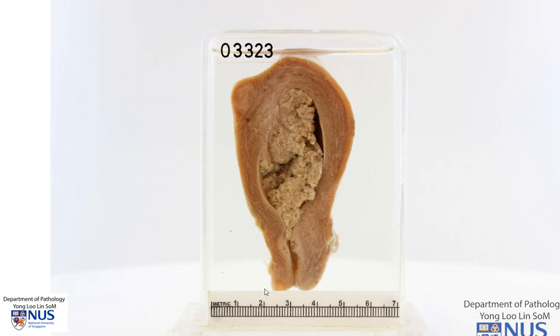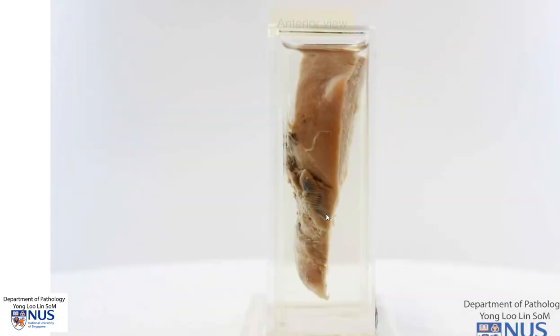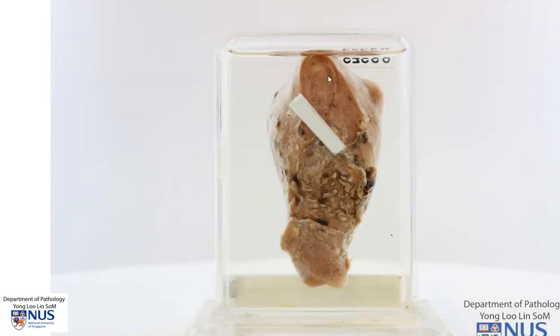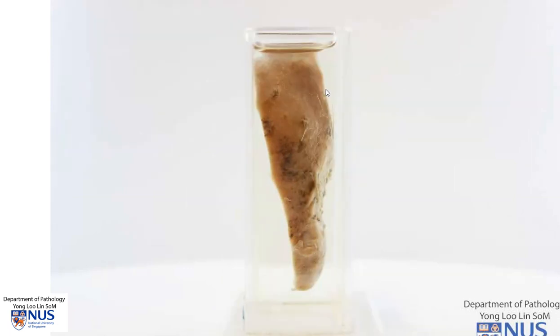Just to orientate you, this is the anterior surface and this is the posterior surface of the uterine serosa. Looking at the anterior surface, the uterine serosa reflects anteriorly off the bladder, so here is the part where you no longer see the serosa because it reflects off the bladder. This is the right lateral surface of the uterus and the adnexa have been dissected away. Here is the posterior uterine serosa surface where you can see the peritoneal covering actually extends a little bit lower down and then reflects off the rectum.